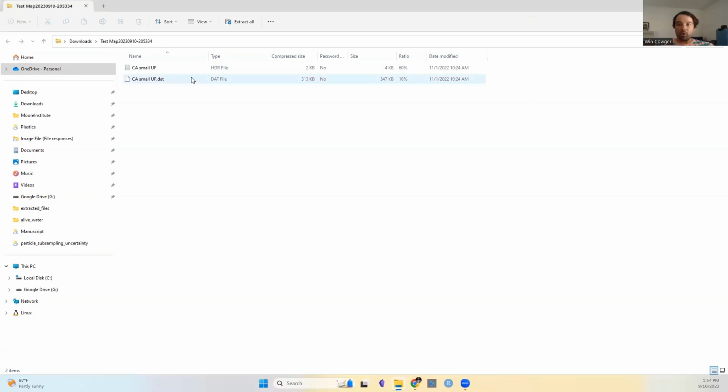Also, for batch upload and batch analysis, if you watch the quick tutorial, I showed an example of how to upload multiple spectral files that don't necessarily have a spatial reference. So if you have a collection of spectra, you can put them all into a zip folder and do a similar type of analysis.